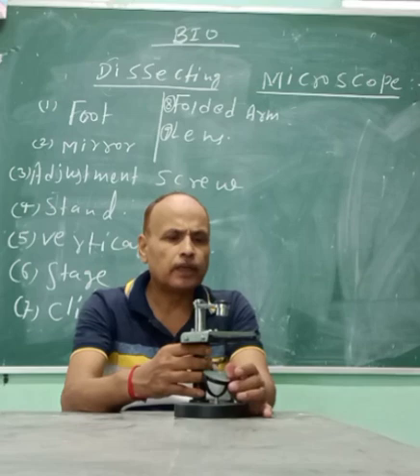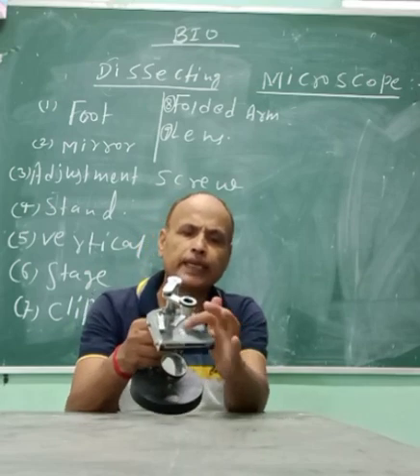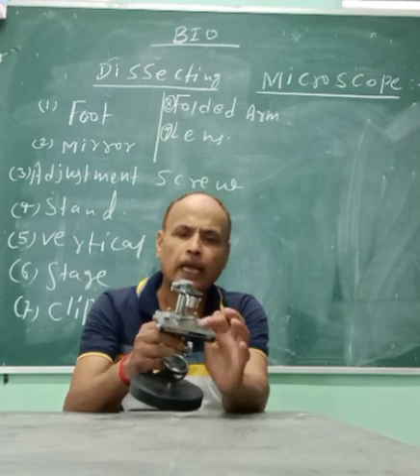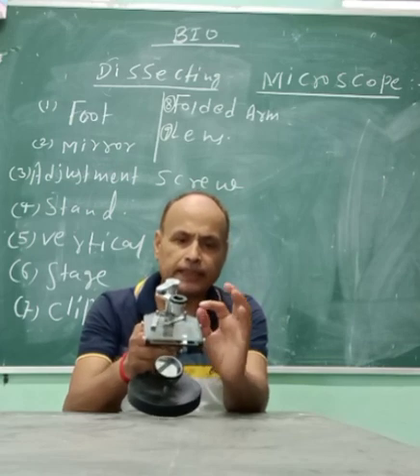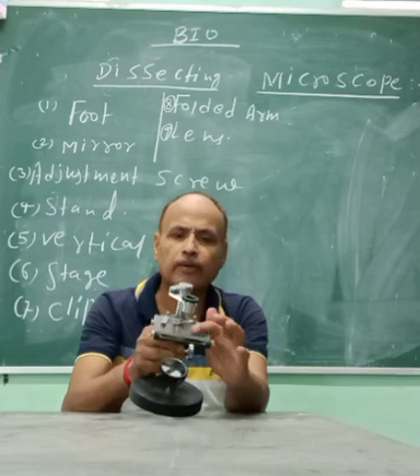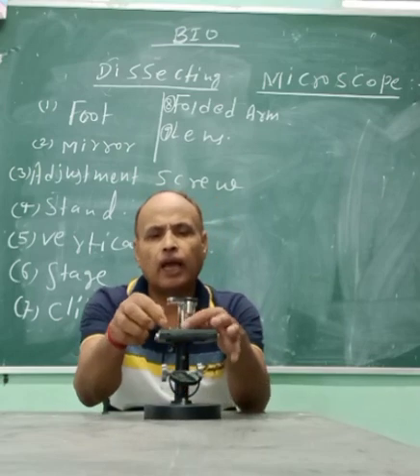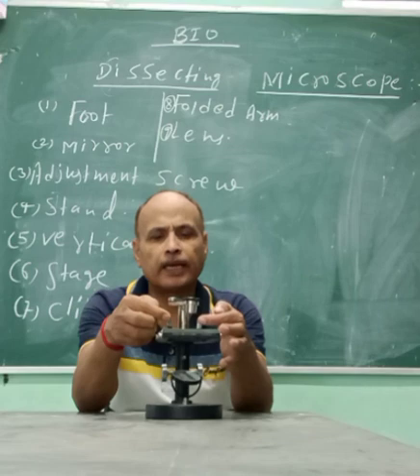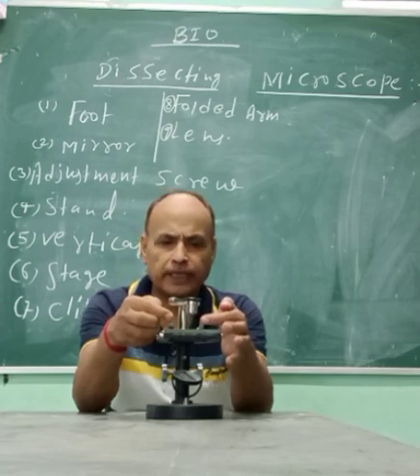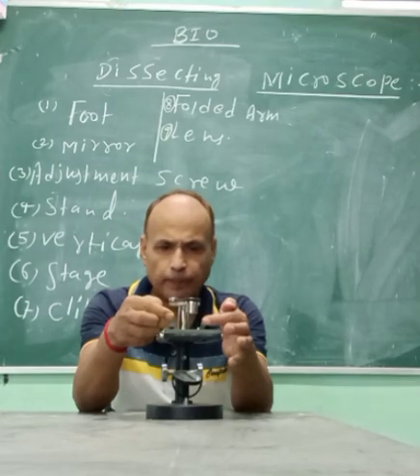One thing to observe: this is the stage. The stage has a piece of glass. That glass piece acts as the stage surface. On the stage there are clips which hold the object slides.